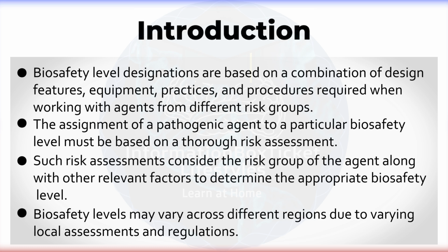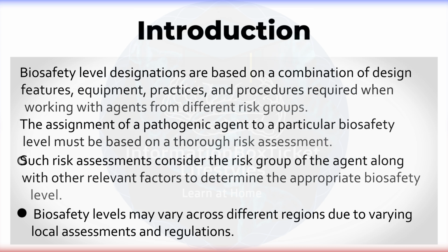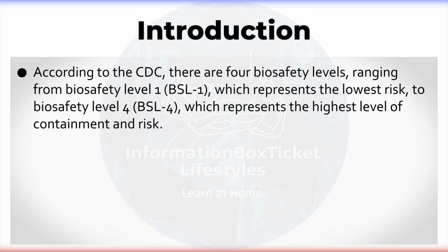Biosafety levels may vary across different regions due to varying local assessments and regulations. According to the CDC, there are 4 biosafety levels, ranging from Biosafety Level 1, which represents the lowest risk, to Biosafety Level 4, which represents the highest level of containment and risk.